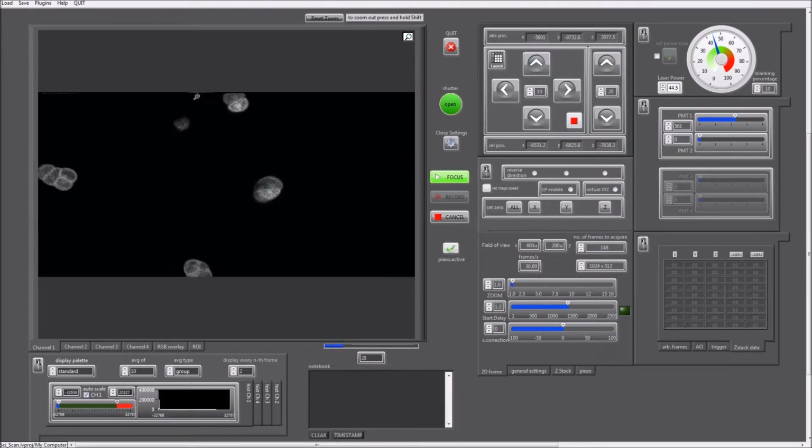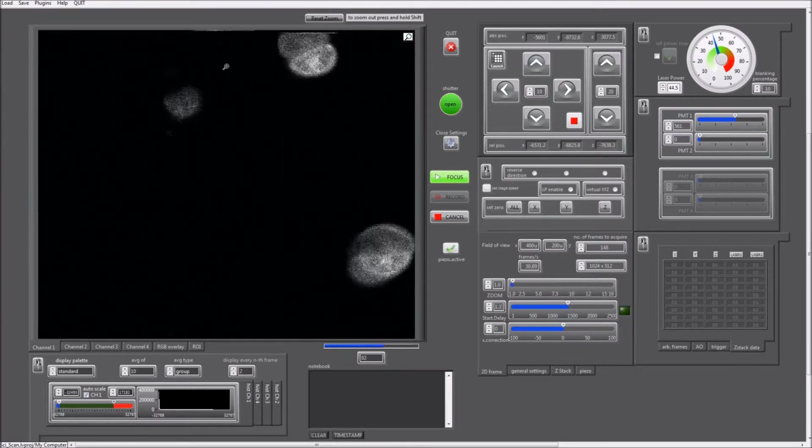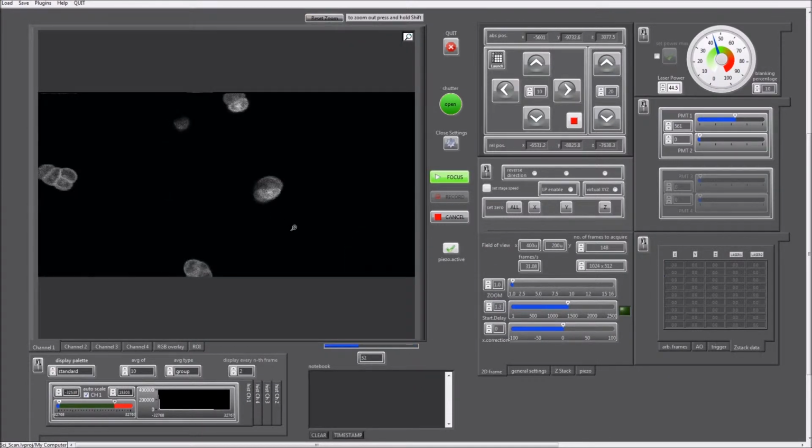Another little thing that I want to point out here is that these white lines up here are the flyback of the Y mirror, meaning that all the data is being written into the image. There's no data discarded, even if it's collected during the flyback of the Y mirror. For analysis purposes, you can safely ignore those lines, but the reason to keep them in the image here is that it makes it easier to reconstruct the exact timing for each of the lines in the image.